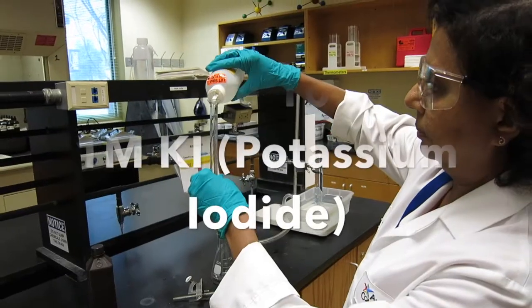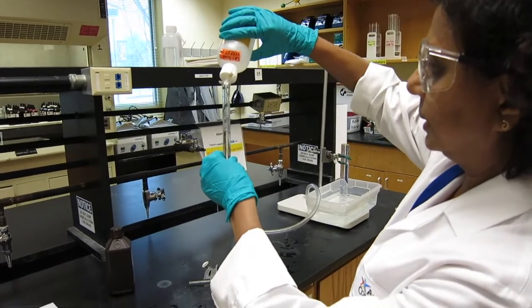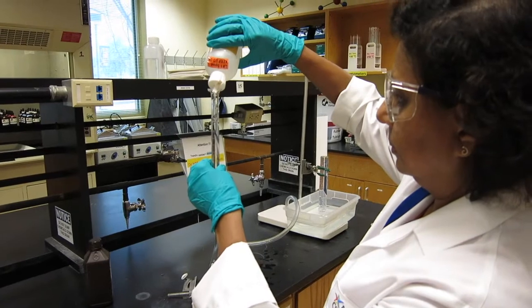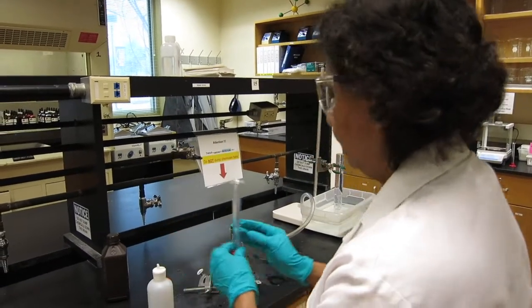Now we're going to measure the potassium iodide, the catalyst. Is it 10 milliliter? Yes. So we're measuring 10 milliliter of the potassium iodide. That's one molar, so it's pretty concentrated.